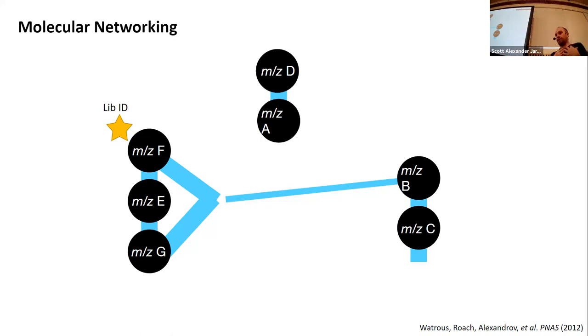And this, for me as an analytical chemist or a natural product chemist, is very powerful, because I see the delta mass between them. I eventually look at the structure, and we see these reoccurring mass patterns, like 14, right, for a methyl group. And I can then say, okay, perhaps there's a methylation. And if I have a hydroxy group somewhere, and I know that in my gene cluster there might be a methyl transferase, then it's easy and straightforward to build up this hypothesis.